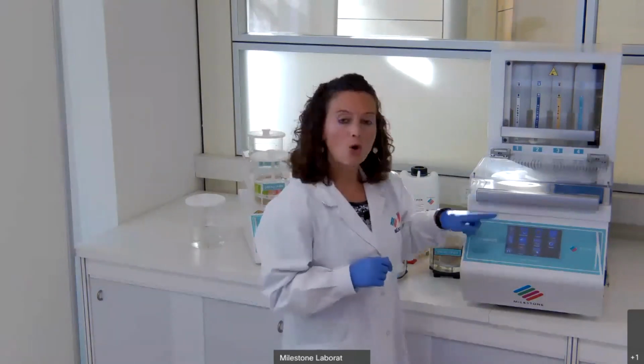Every time you start the process, the decalmate will ask you how many cassettes you are putting inside. This is very important to check the quality of the reagents. Through a simple color-coded icon status, we can understand if the reagents are good to go, and the color is green; are quite close to expiration, and the color is yellow; or need to be replaced, and the color is red.